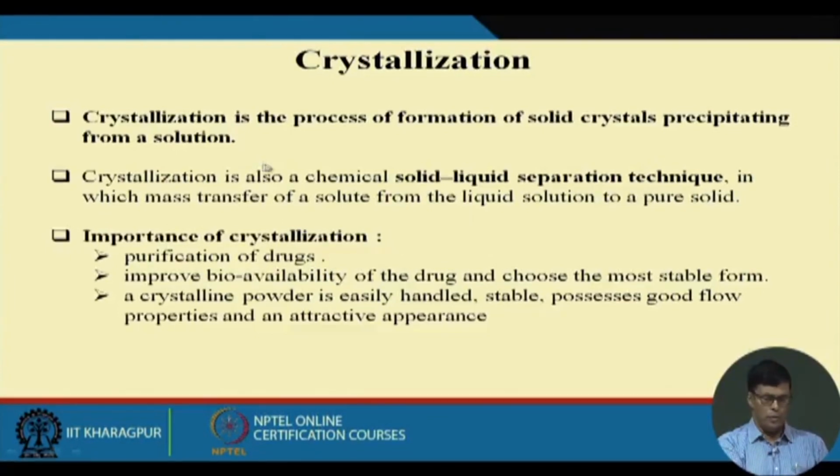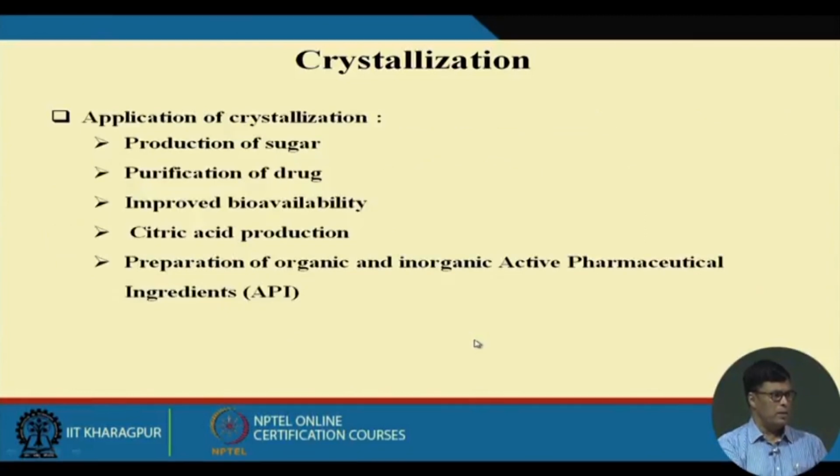Now I told you that crystallization is the process of formation of solid crystals precipitating from a solution. Crystallization is also a chemical solid-liquid separation technique in which mass transfer of the solute occurs from the liquid solution to a pure solid. The importance of crystallization is the purification of drugs, improved bioavailability of drugs, choosing the most stable form, and a crystalline powder is easily handled, stable, and possesses good flow properties and attractive appearance. So you know that this is crystallization.